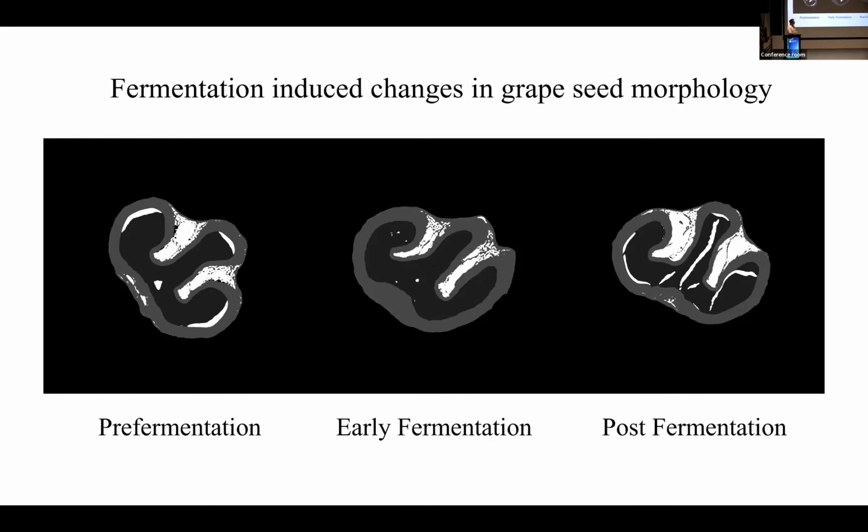And so we're actually going to start getting tannin extraction from the pores on the inside of the nucellus, which explains why the extraction rate doesn't change, right? There's a lot more surface area in the nucellus now, and that explains why the tannin extraction stays constant.